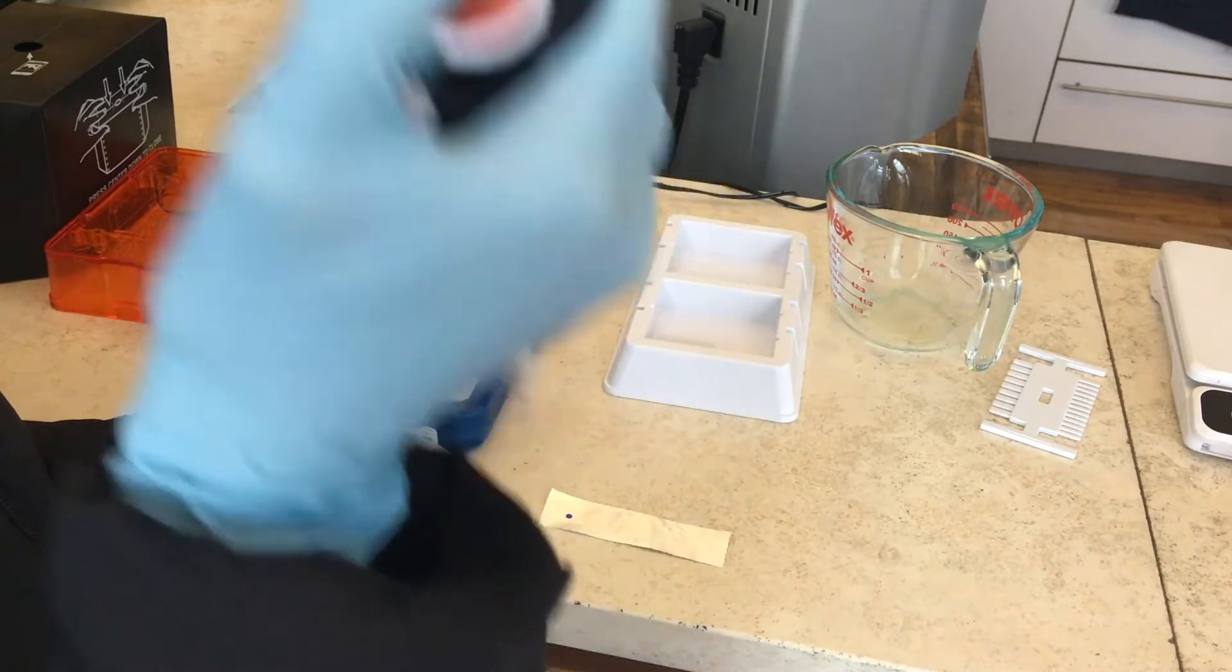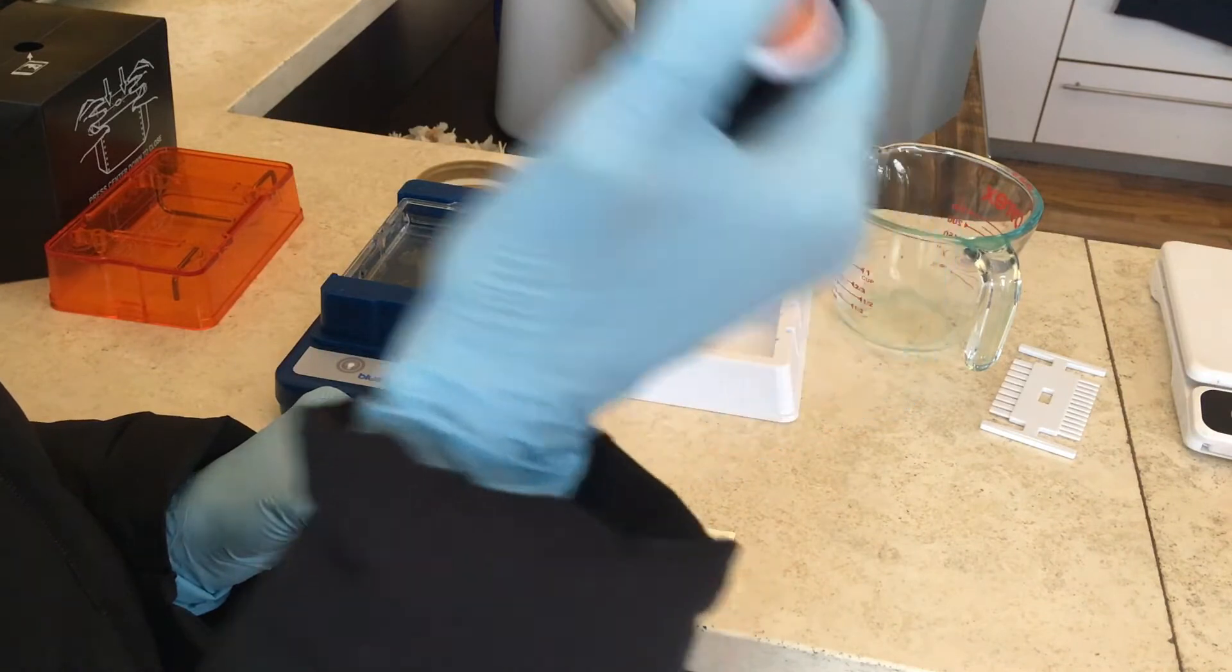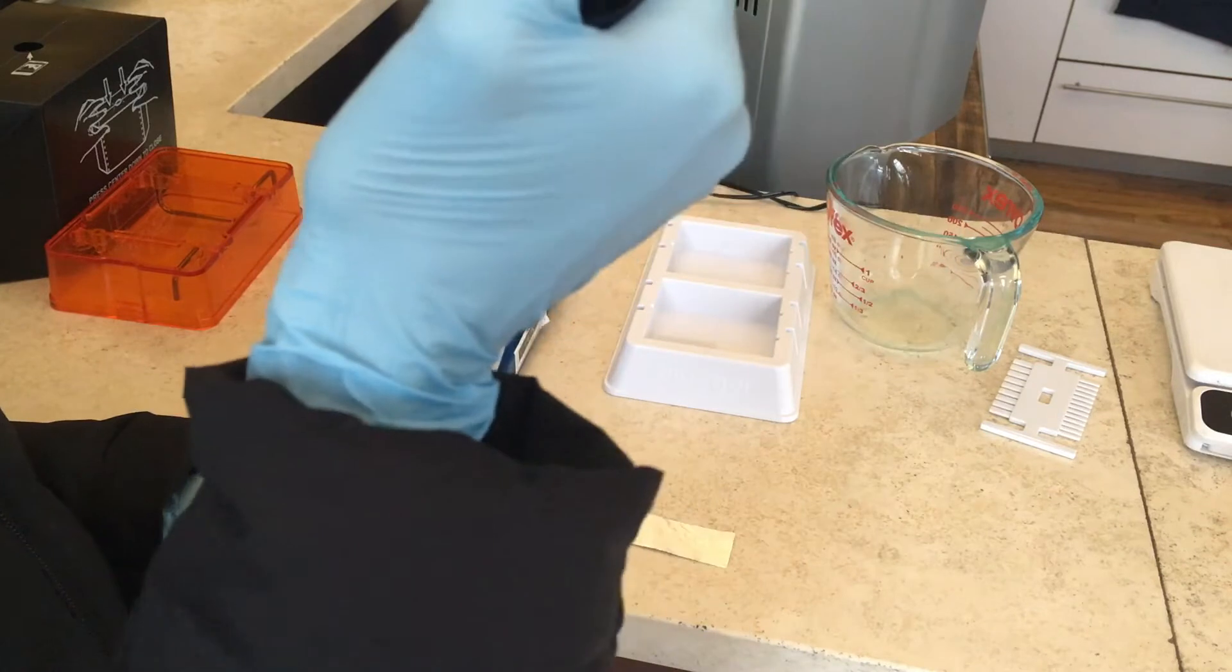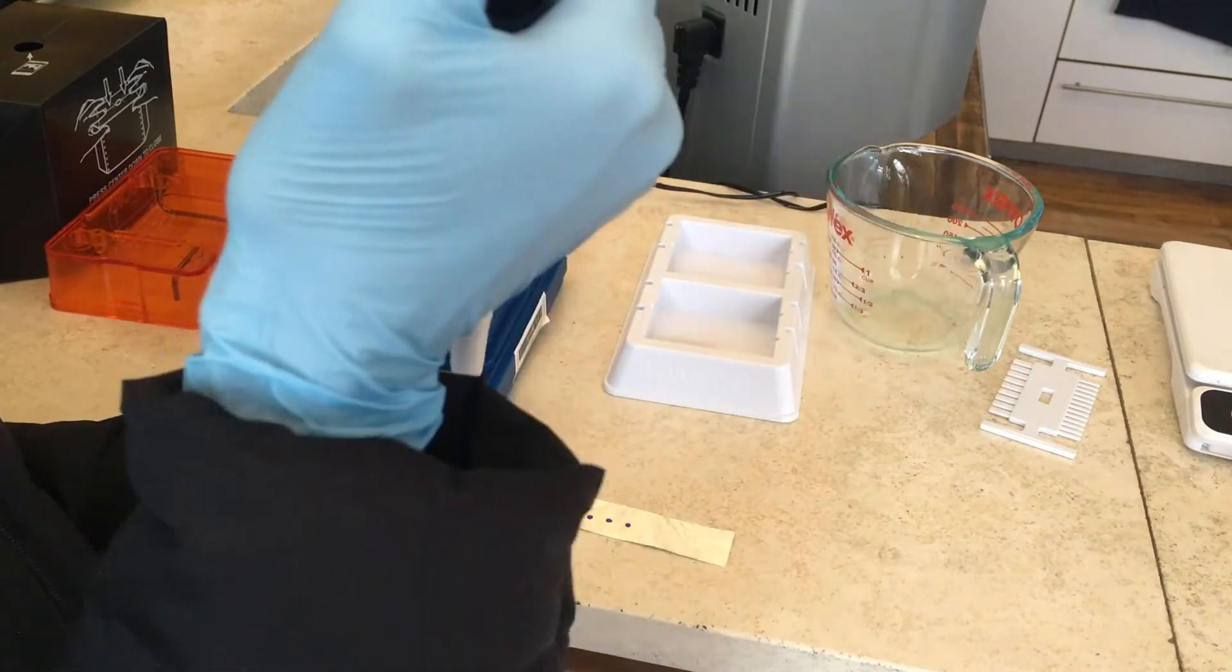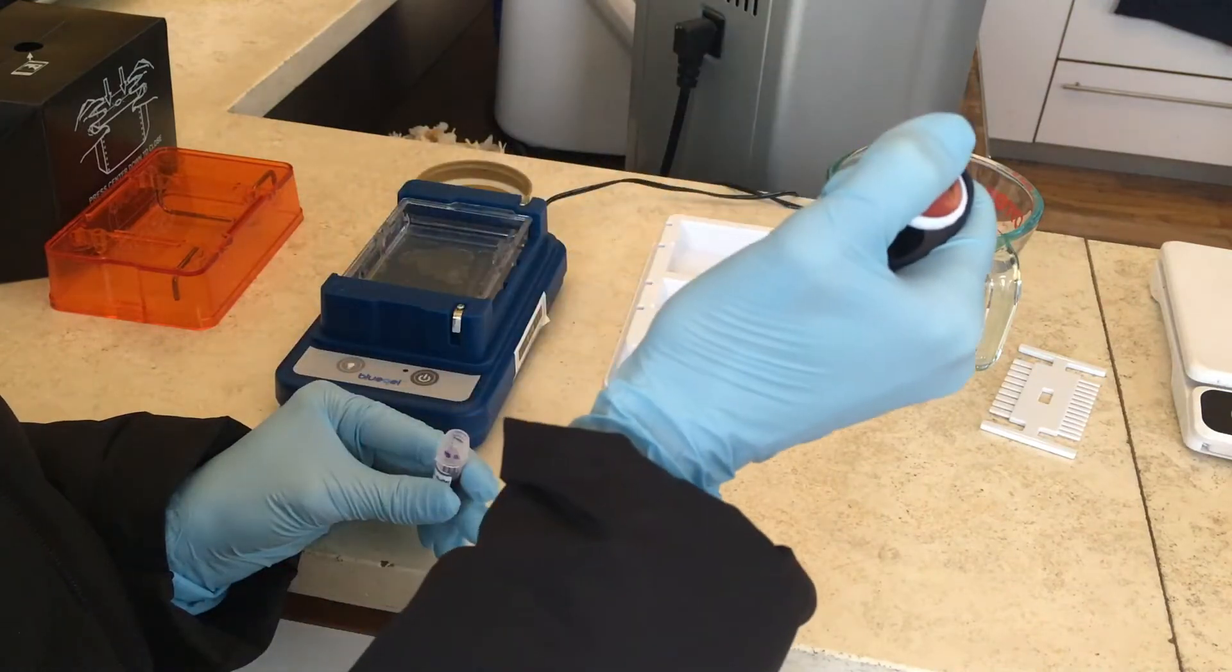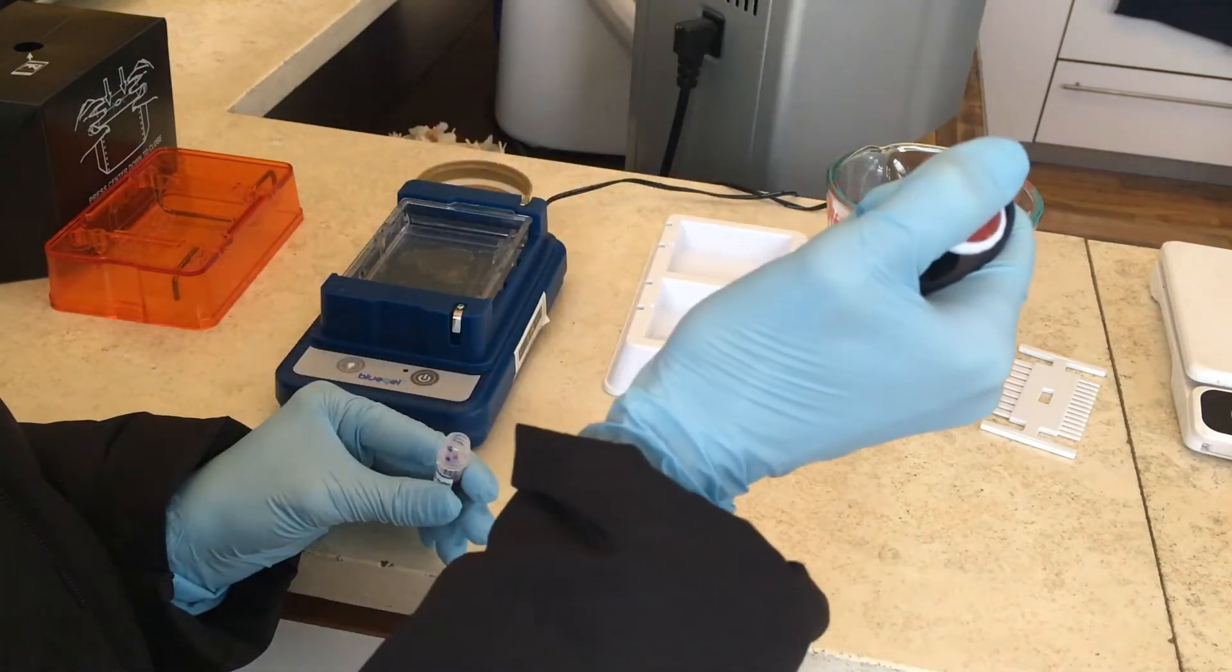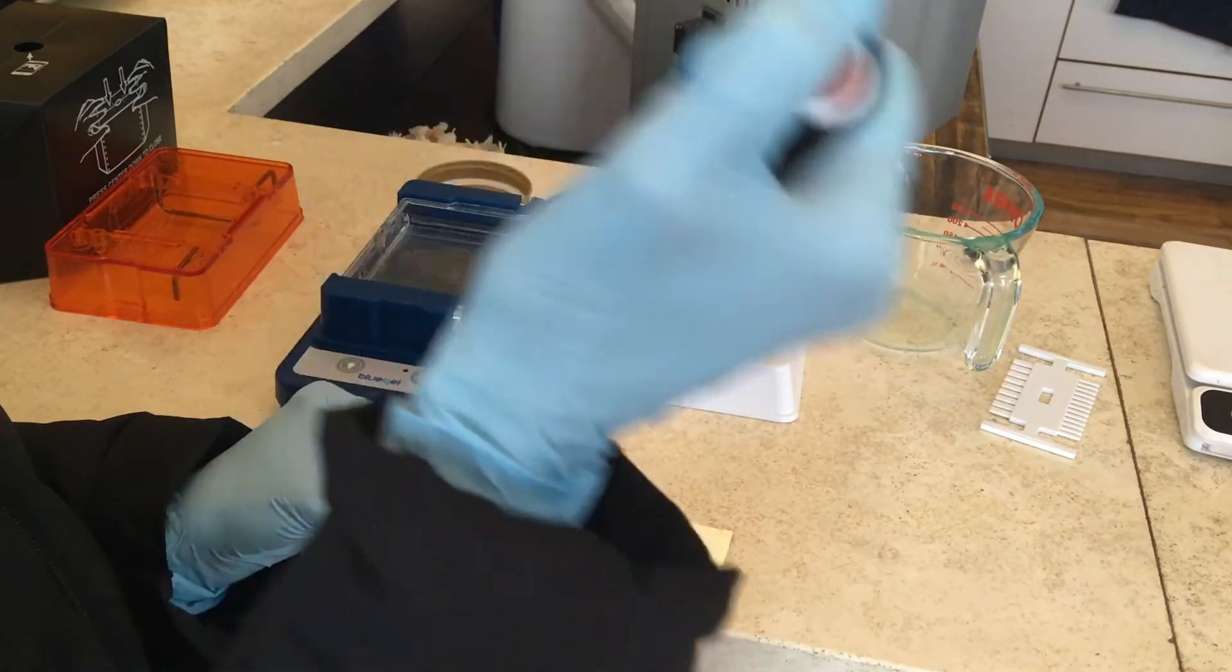The reason we're doing it like that is it's easier to mix the individual mushroom samples with the loading dye if we just do it drop by drop. So we're going to individually mix them on this piece of aluminum and then we're going to drop them into the gel. So we're going to do this eight times.